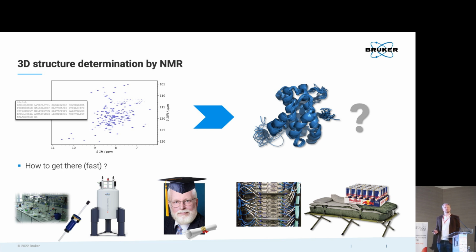Now what you need next, and you need to know that so far, determining a structure by NMR is mostly a manual process, and it involves a person that is willing to do this. Ideally, it's a dedicated person, and also a person that doesn't easily get bored. For lack of a better example, I'll just put younger myself down there. And also that person is going to need some training.